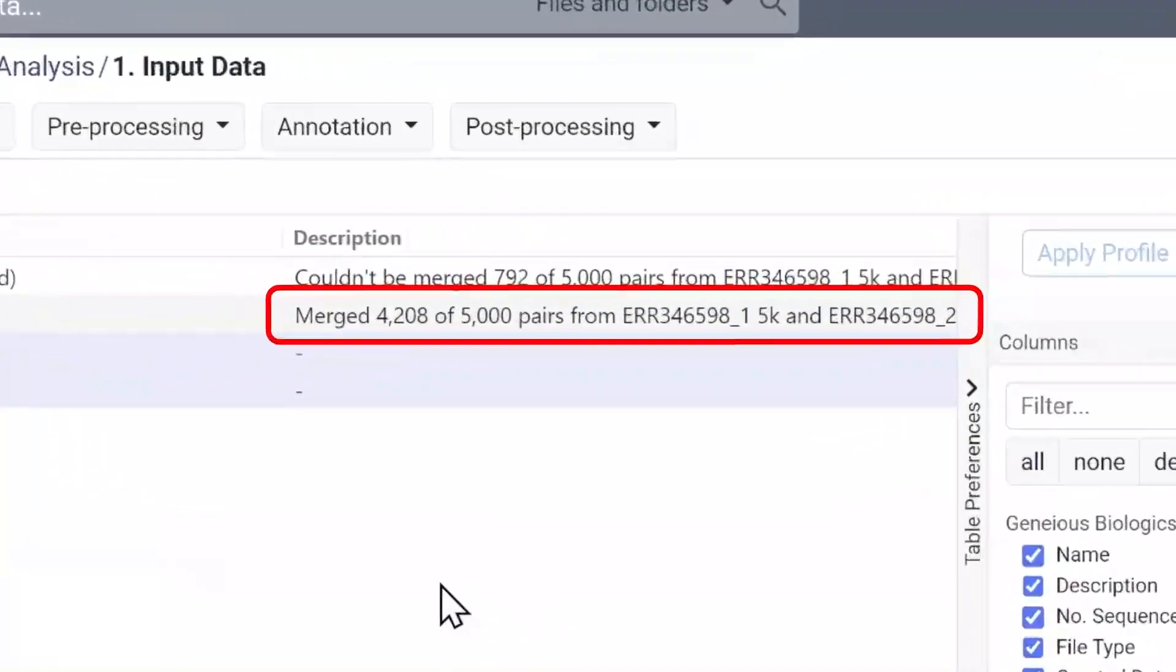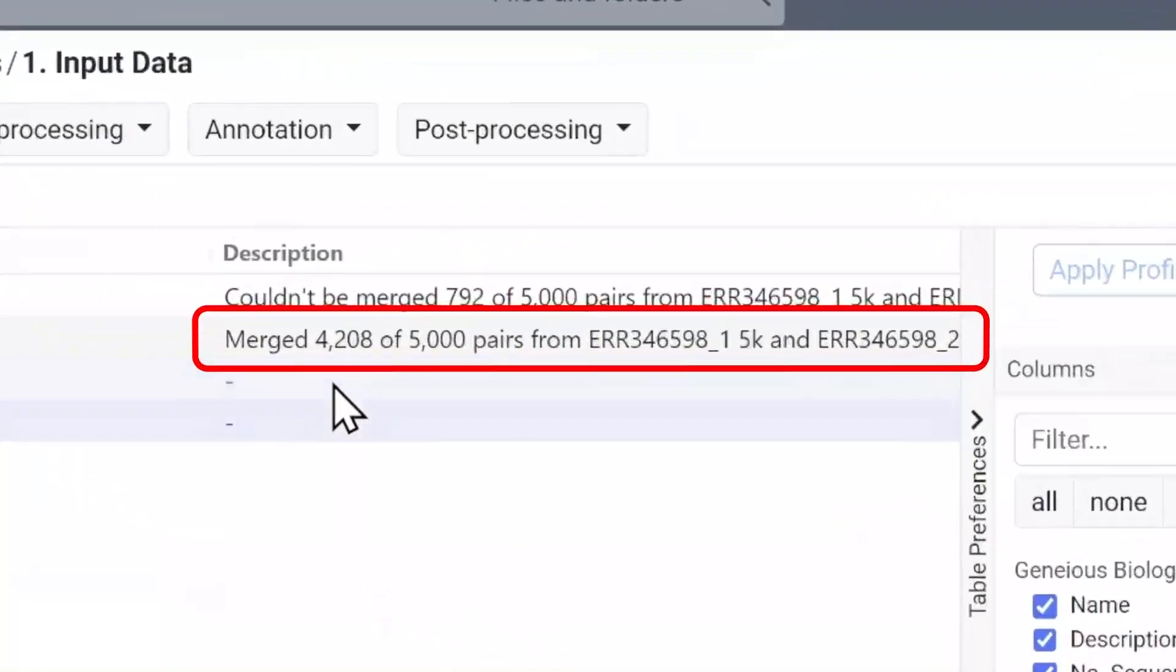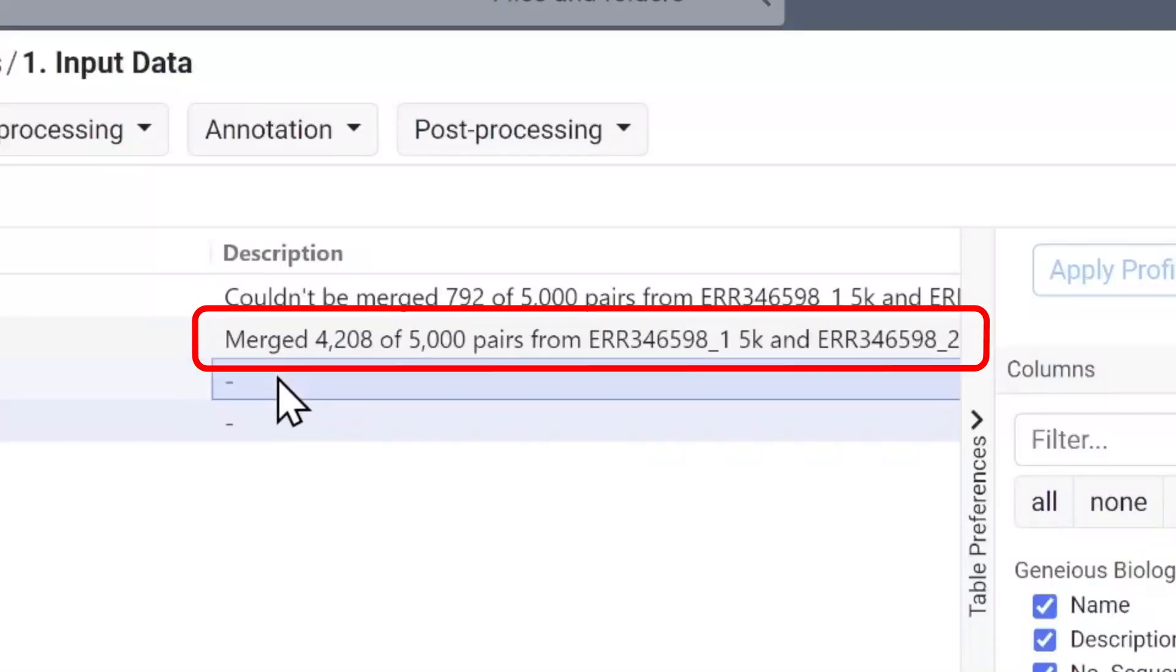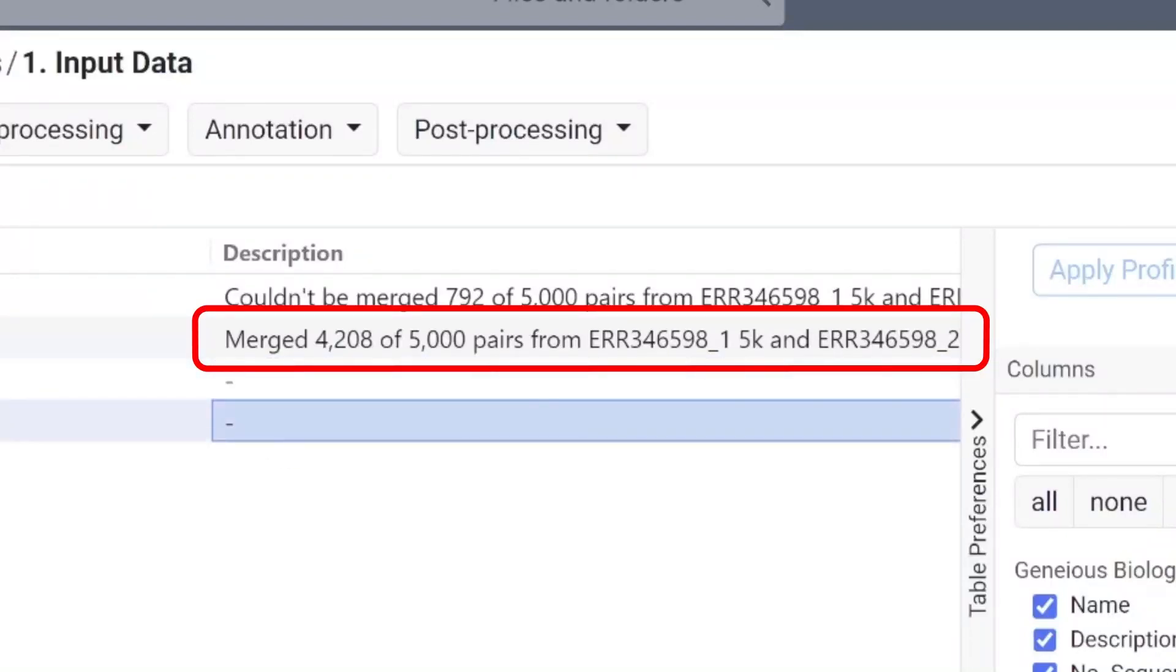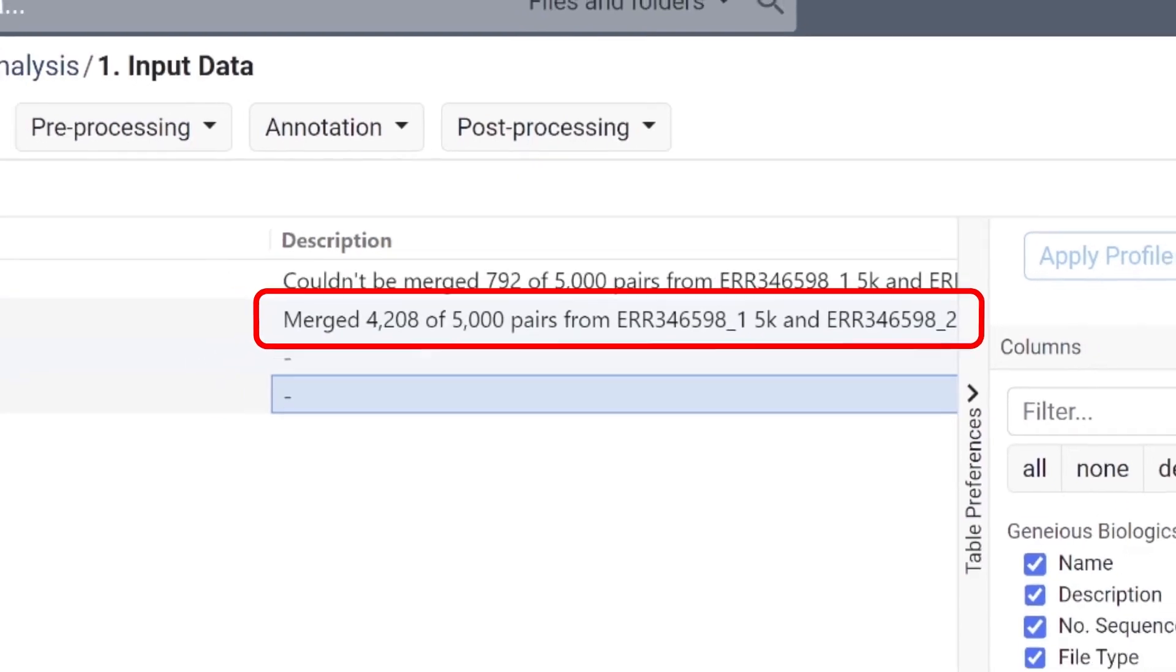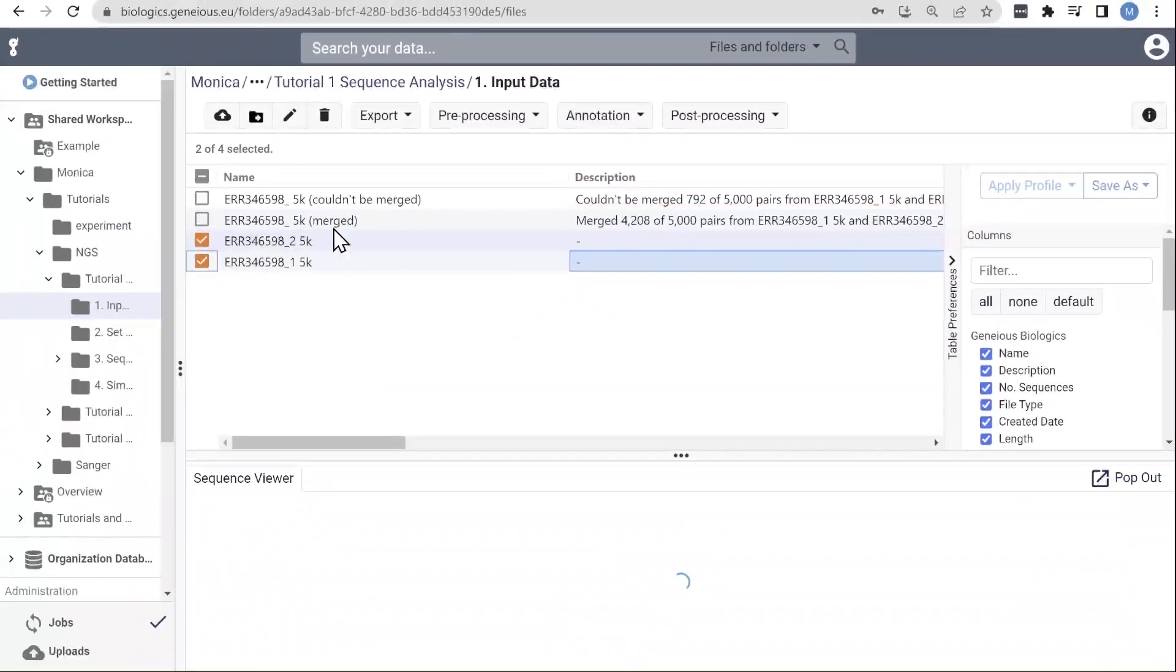4208 out of the 5000 sequences were merged, indicating most of the sequences were merged in this example. It's typical for Illumina MiSeq data to contain some poor quality and unmerged sequences. As long as a majority of sequences merge, we can still proceed with the analysis.